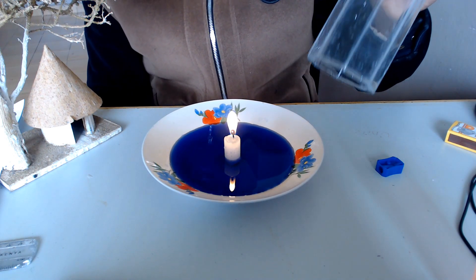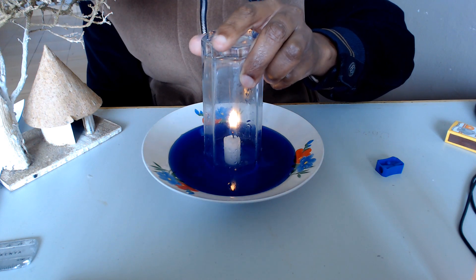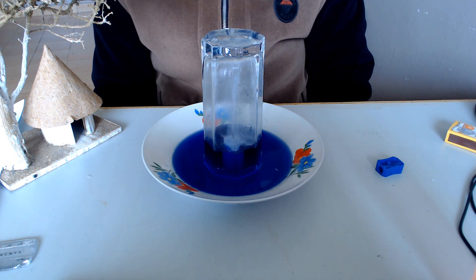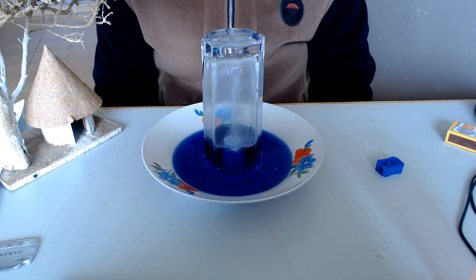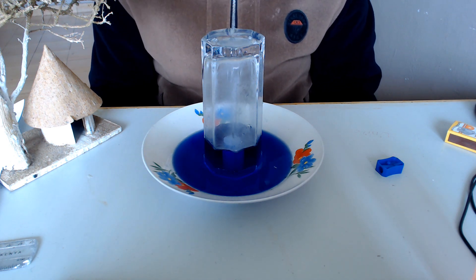And here we go. One, two, three, four, five. Wow. And that is the experiment, and it has worked perfectly, just as I expected it. So now we go to some conclusions about the experiment.